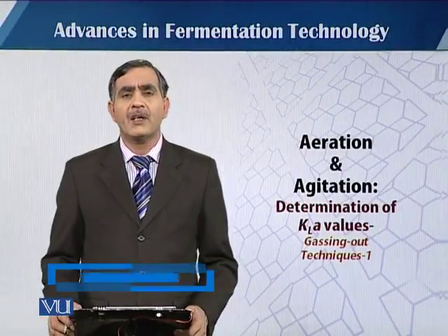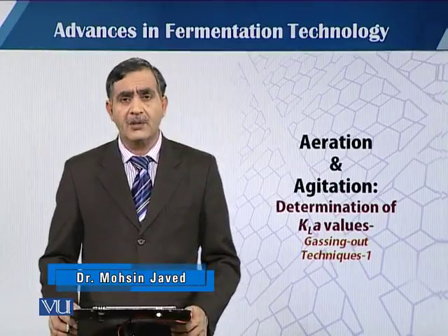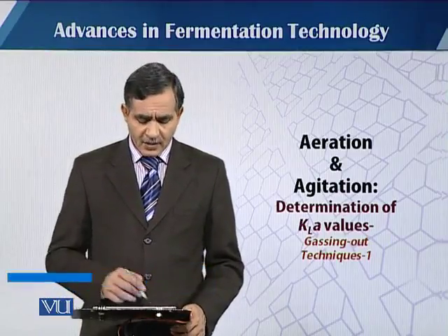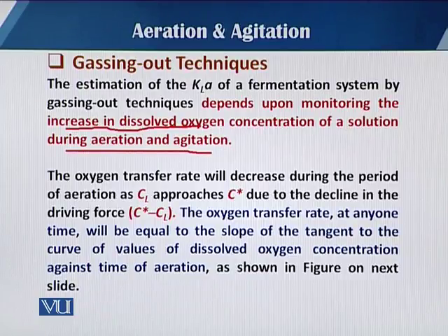In this module, we will talk about the determination of KLA values by the gassing out technique. What is the gassing out technique? As far as the gassing out technique for the estimation of KLA is concerned, it depends upon monitoring the increase in the dissolved oxygen in a solution during aeration and agitation during the fermentation process.